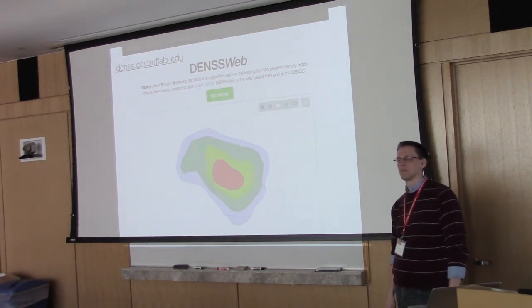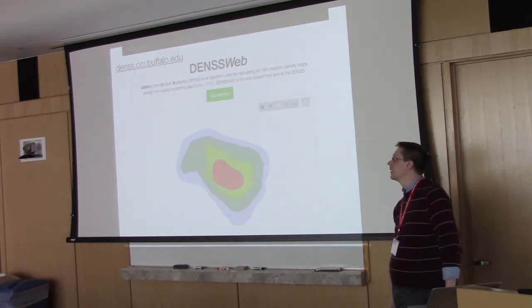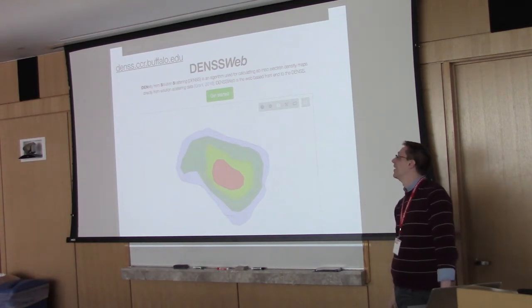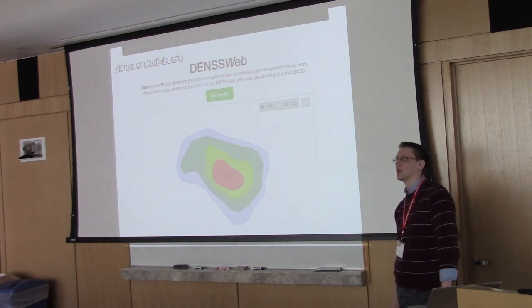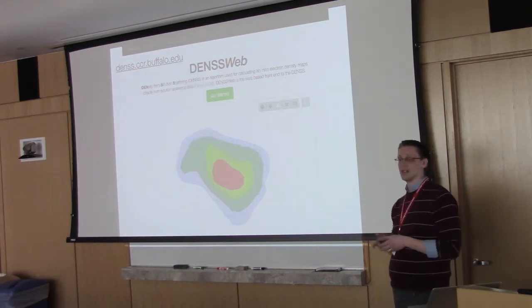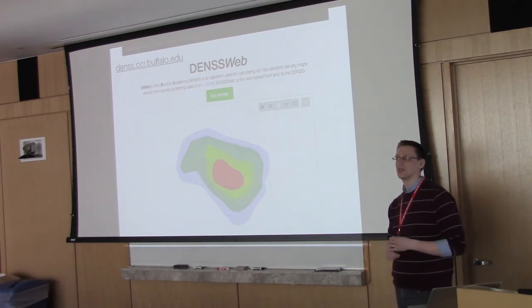So even if we do buffer subtraction when we collect the data, we have to do solvent flattening. Yeah, sure. So for now. One of the versions I'm working on, I have like 37 different versions of this thing, all my different branches, could potentially eliminate the need for buffer subtraction, or at least get around to potentially getting correct buffer subtraction. It does this by actually modeling what the buffer looks like. There's no necessary restraint that it has to be protein. I've actually run it with just water, and it reconstructs the density of water pretty well.